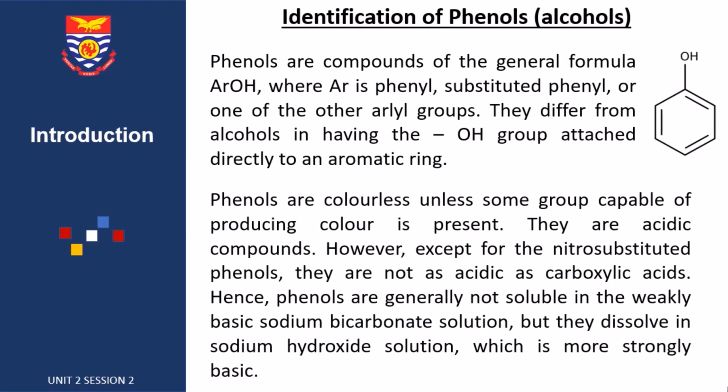Now there's also the identification of phenols. Phenols are compounds with the general formula ArOH. Please take note of that. Phenols are colorless unless some group capable of producing color is present. Without a chromophore, which might give a color to the phenol, phenols are basically colorless.